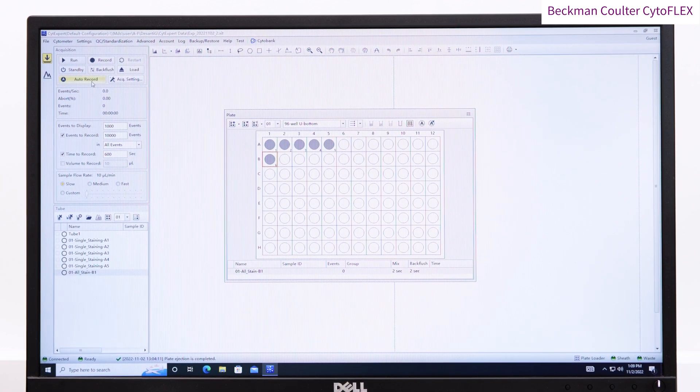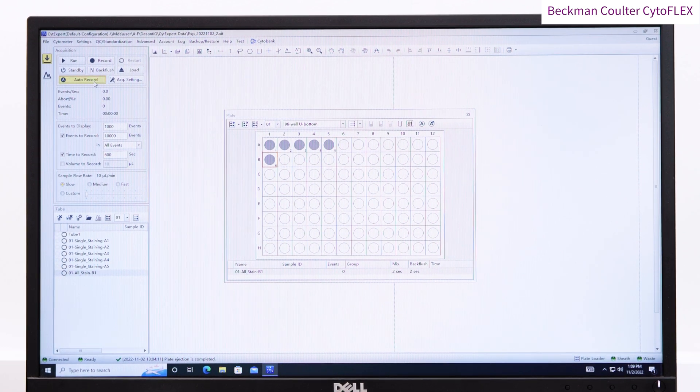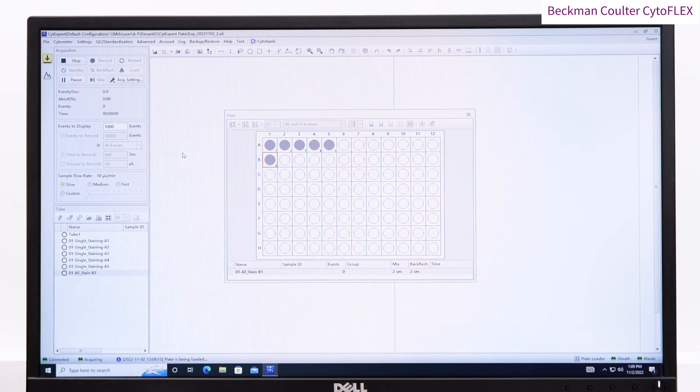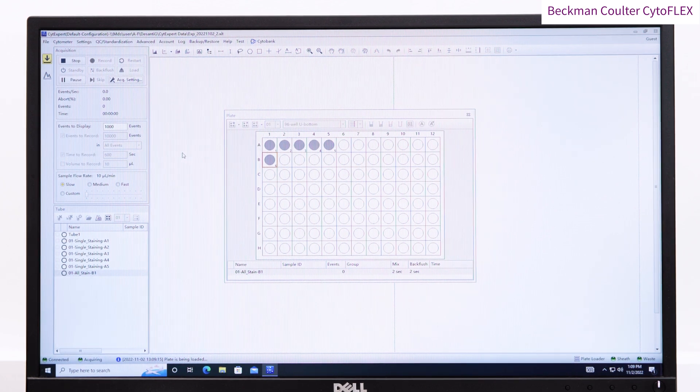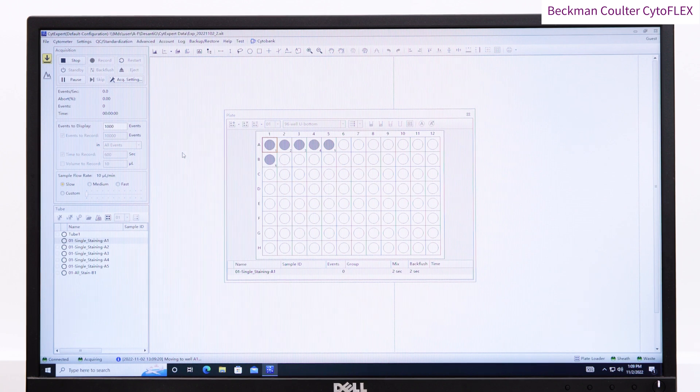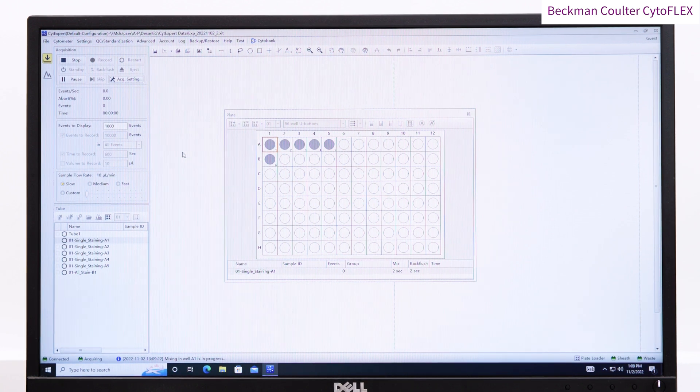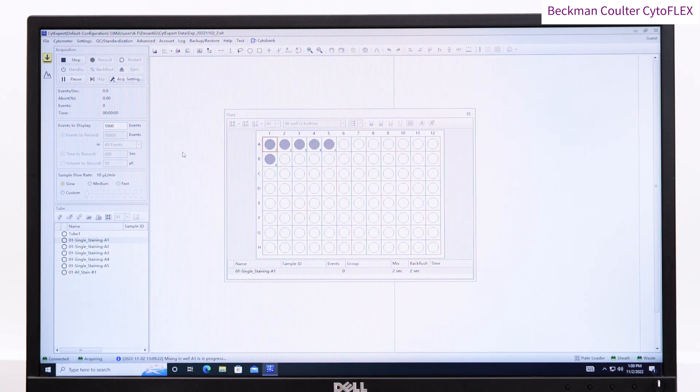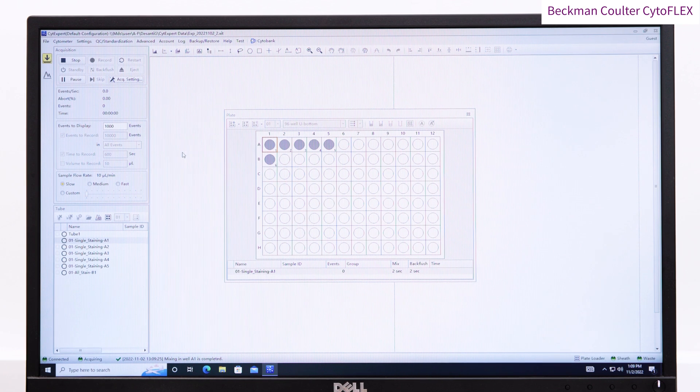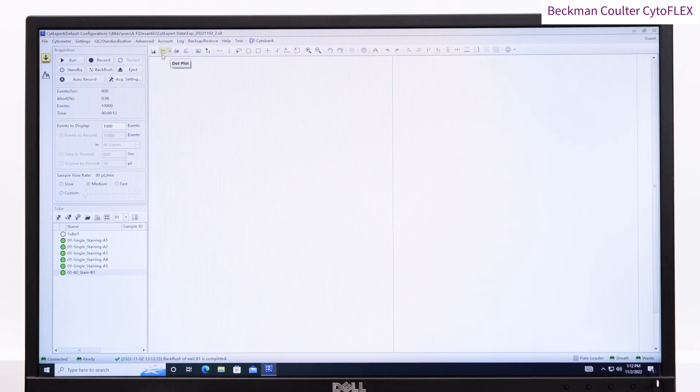You can now choose to either click on individual wells and press record, or press the auto record button to run all the wells. OK, let's examine the data.